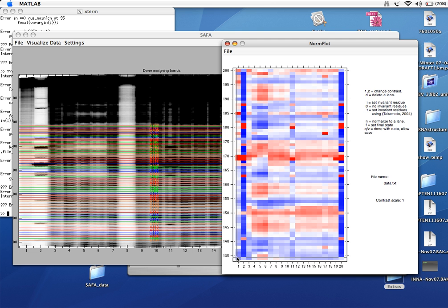So again, it starts at nucleotide 134 all the way up to nucleotide about 200, the 67 nucleotides. And here are exactly the 20 lanes that we did. So you can see that there are several options here. For example, the thing I usually do when I'm quantifying data, first of all, is I'm going to remove the T1 ladder lanes because those aren't very important.